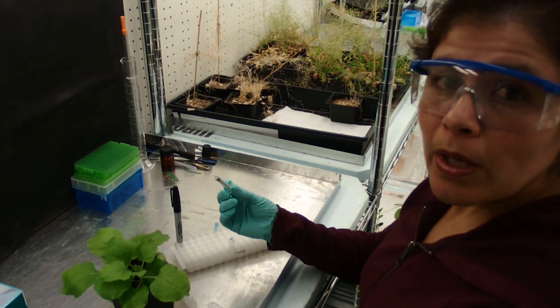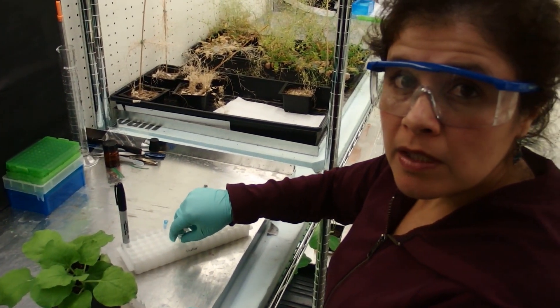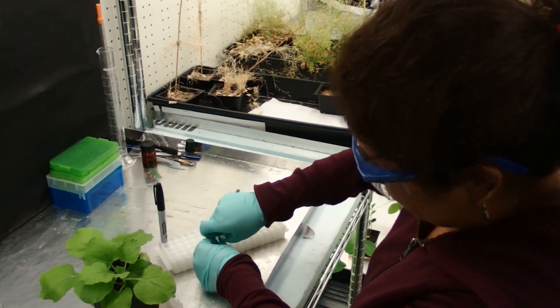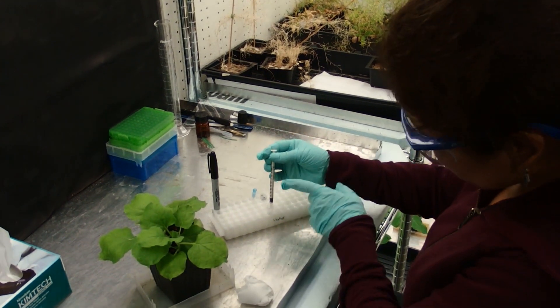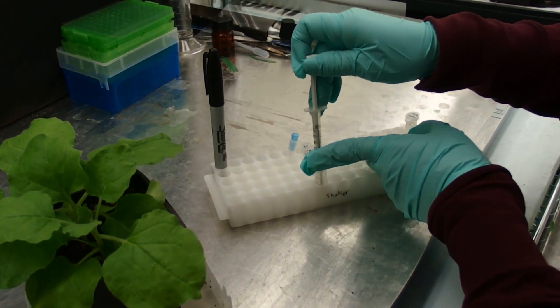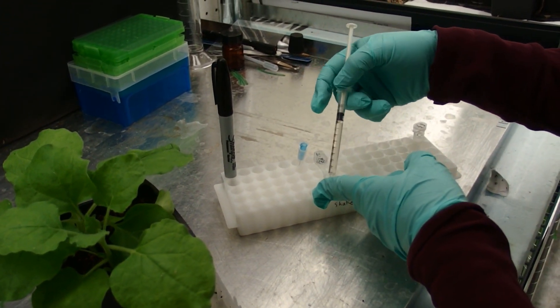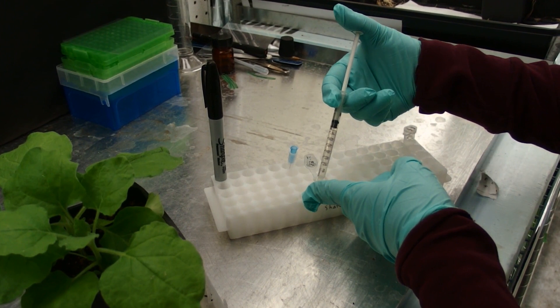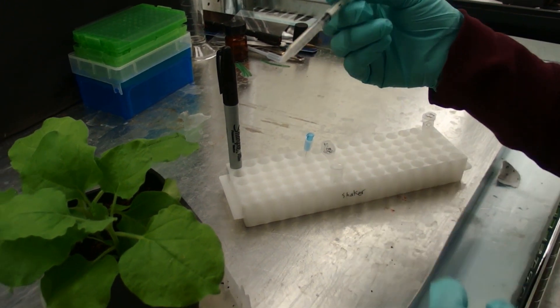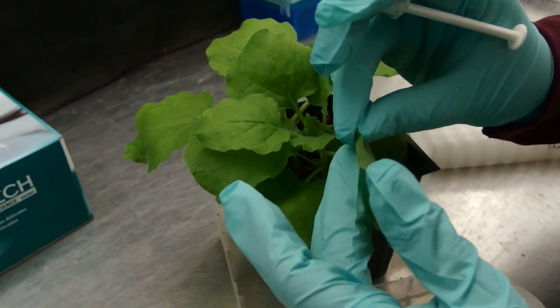We are going to use a 1 ml syringe to take out the bacteria culture and infiltrate it into the back of the tobacco leaf.